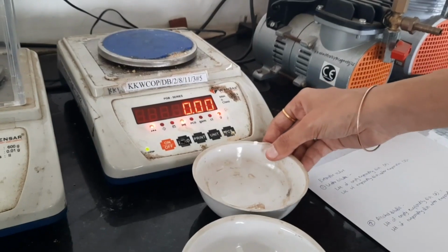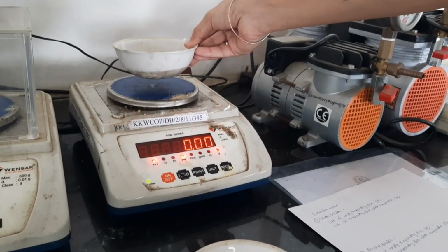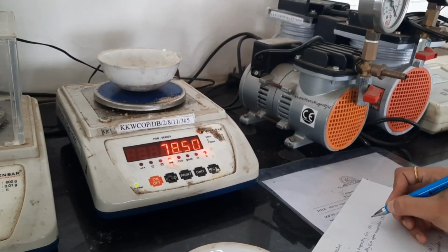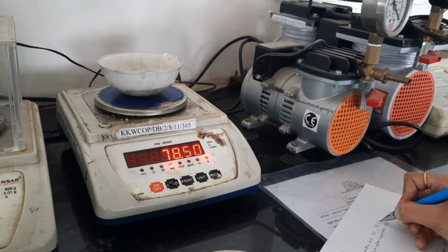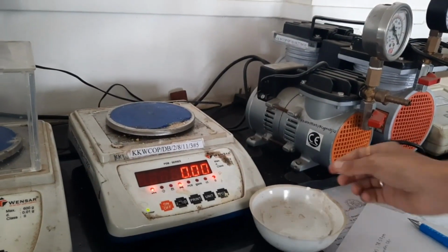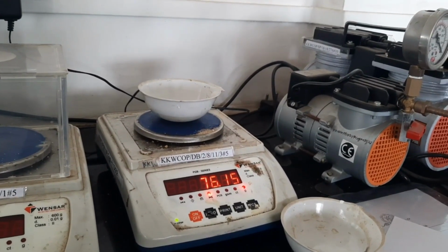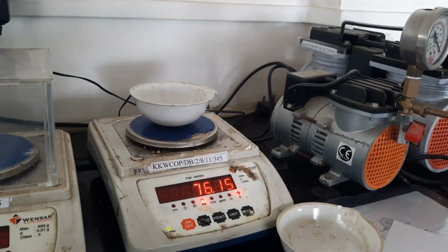Now we will note down the weight of the petri dish, that is the evaporating dish, to calculate the extractive value. First, this evaporating dish we will use for water soluble, so the weight of the evaporating dish is 78.50 grams. And this dish we will use for alcohol soluble extractive value, and the weight is 76.15 grams.